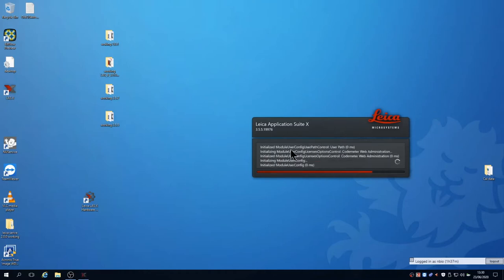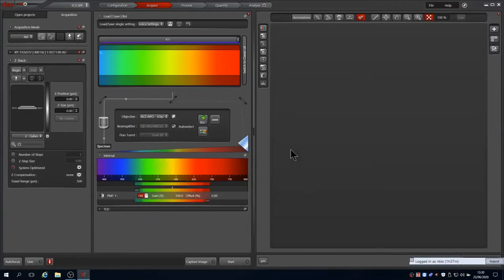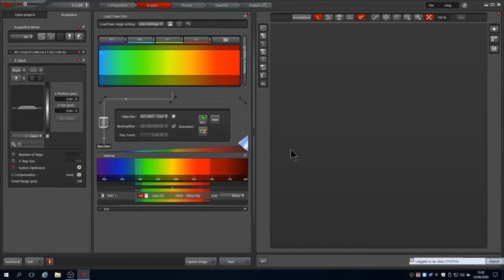The system boots into the acquire tab which has three panes. The one on the right shows the current live image or selected image. The central one shows the beam path with lasers used and detection settings. The left one has two more tabs, open projects and acquisition, which displays the current settings for the image.